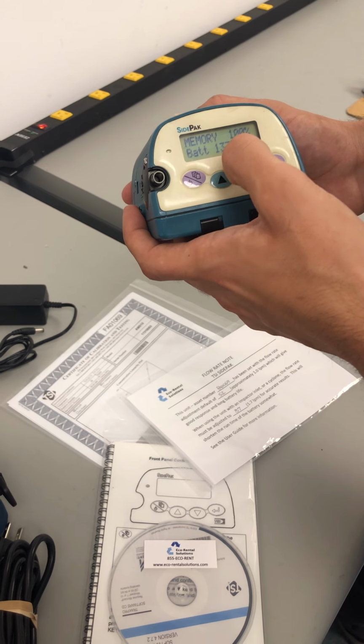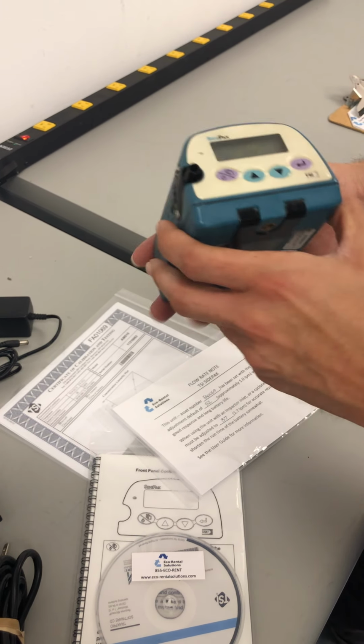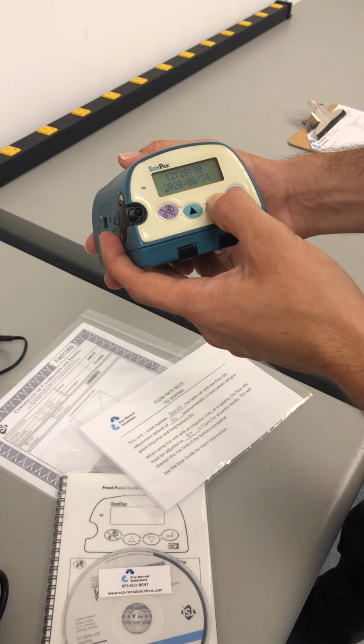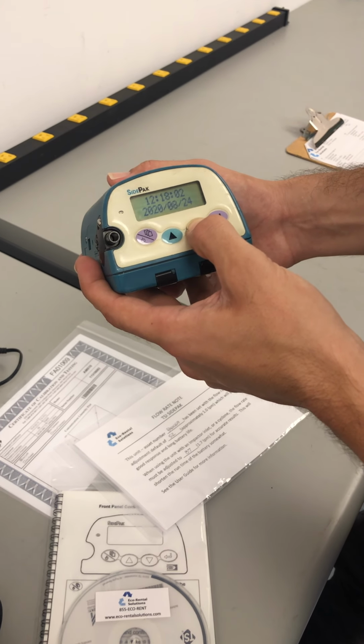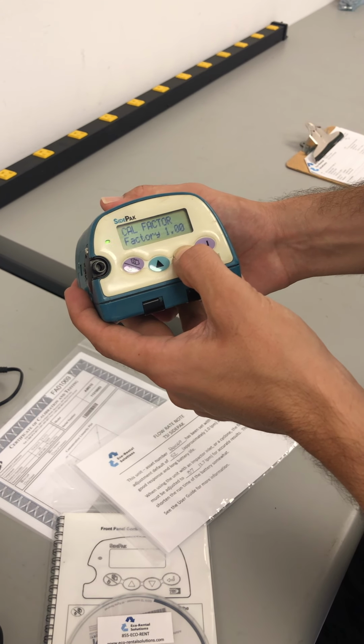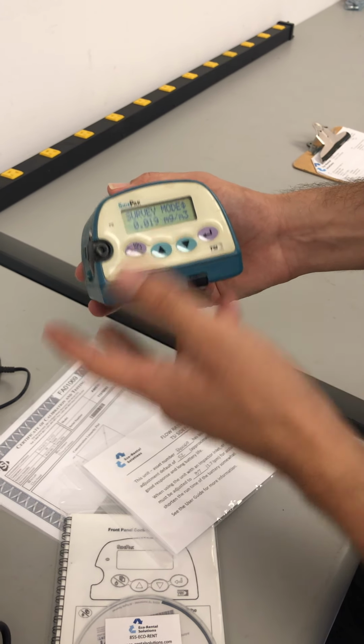So we have about 140 minutes left. So it looks like we may want to charge it a little bit. Okay. This will have some more information, just show you time and date. Your cal factor, which we've set to our default. Shouldn't have to worry about that. And then we go right back to survey mode.